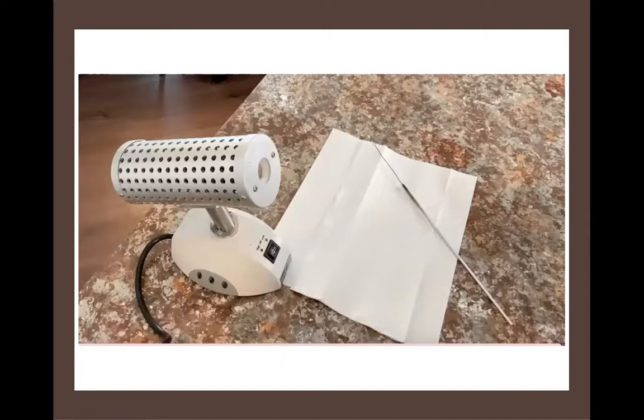Now, as you've seen, there are really two primary types of culture containers that we encounter most often in the laboratory. There are test tubes, and those can have liquid media in them. They can have a semi-solid media in them. They can even have solid agar in them. The other container we see is the Petri dish, the plastic single-use lidded dish. We often refer to these as plates. And those agar plates have a thin layer of solid media on the bottom.